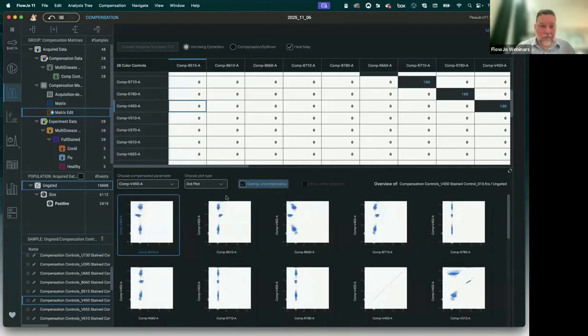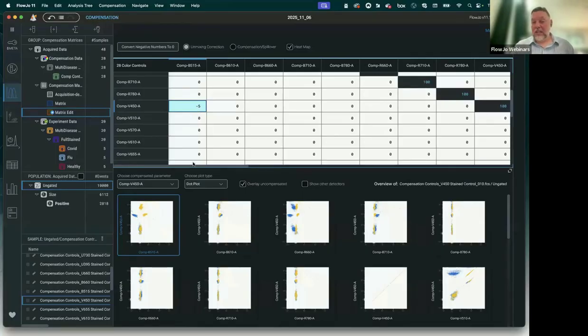As an example, I'm sorry, I'm not polished on this one, guys. This is my first V11 webinar. So we're going to change some interaction here, right, between 450 and 515, and you can add or subtract information, see how that changed the skewing. You can go towards the positive by going with a positive number, or to a negative number going to the right. Small changes, of course, can have big impacts, so be careful and don't willy-nilly change these things.